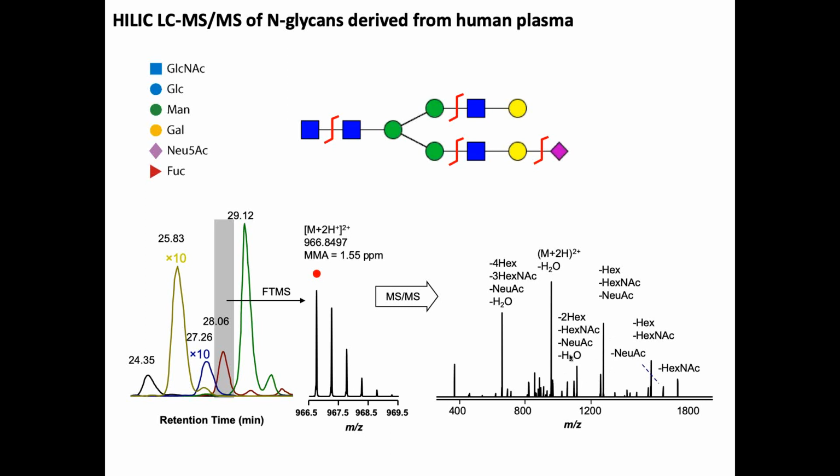These 3 pieces are the key foundation for what you're going to use for identifying unknown glycans, particularly those that are not templated. We don't have anything to match this up against unless we have a spectral database or we're using a piece of software like SimGlycan, which could really help us in some ways. We're just getting started with that. Okay?